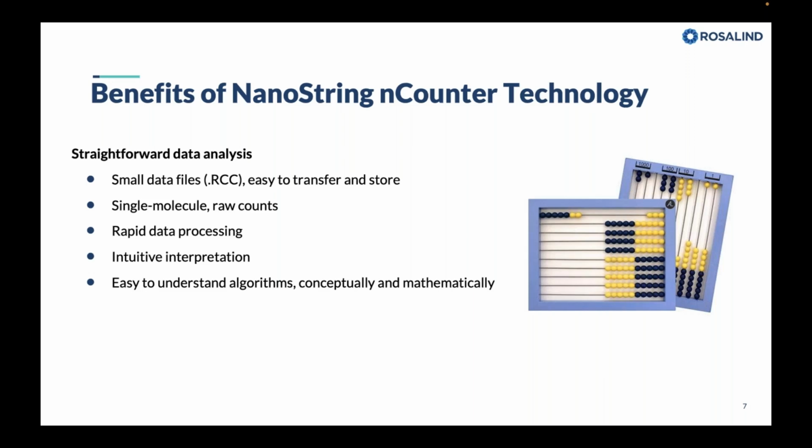So again, I'll just emphasize this last bullet point here. At the end of today's session, I want you to walk away with an understanding of the NanoString pathway analysis and how it works. Because if you don't understand how the math works, then you could potentially be limited in how you interpret the results. So that's the focus of today's session.